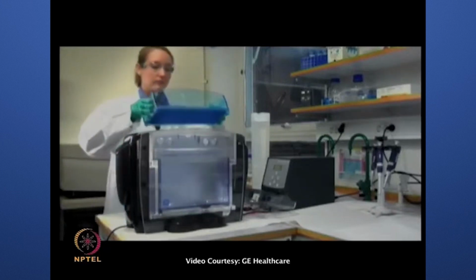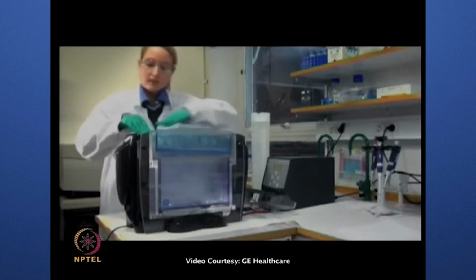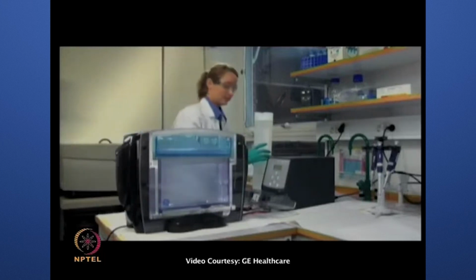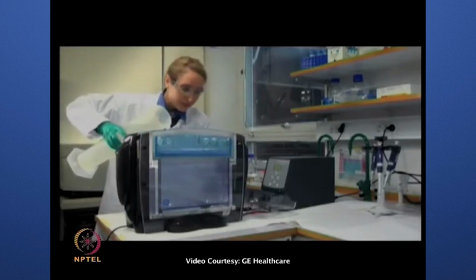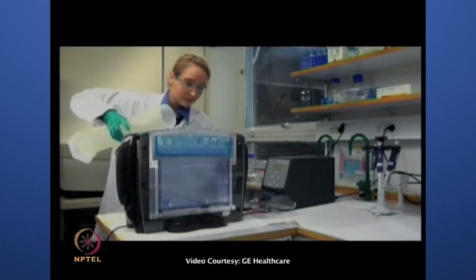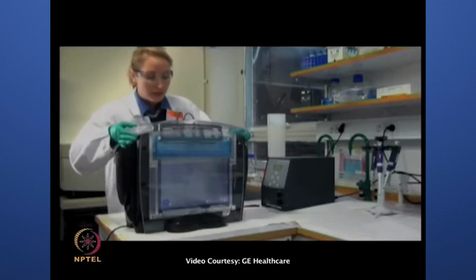In the second dimension SDS-PAGE, the proteins will be separated according to molecular weight, and this is performed with the Ettan DALT 6 system. Fill the electrophoresis chamber with anodic running buffer, insert the gels and fill the top compartment with cathodic running buffer. Program the power supply according to recommendations and run the second dimension protected from light for approximately 4 to 5 hours or until the dye front reaches the bottom of the gel.